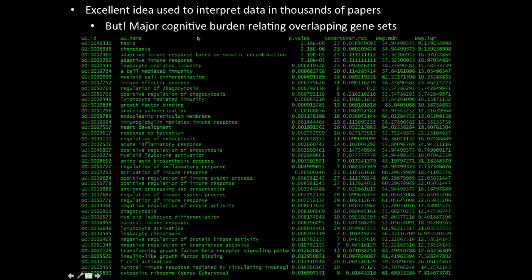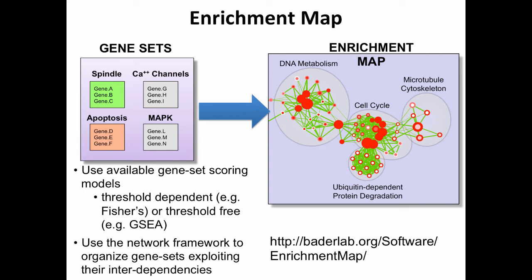One of the problems is that there are a lot of similarities between the pathways resulting from these analyses. If you get a long list of pathways, there might be many immune-related pathways - but unless you know a lot about immunity, you might not know that some of these are directly related to immune response because they don't say 'immune' in the name. These relationships are not obvious in table format. Enrichment map is a visualization method that visualizes the results of enrichment analysis as a network - and remember, networks are good for visualizing relationships.